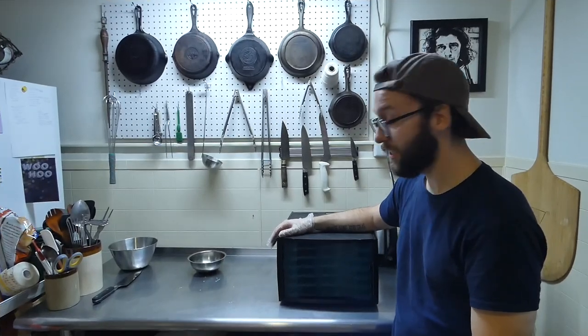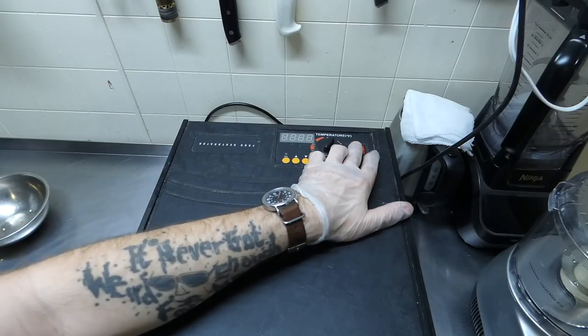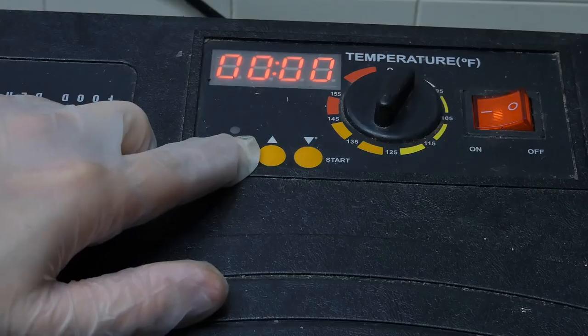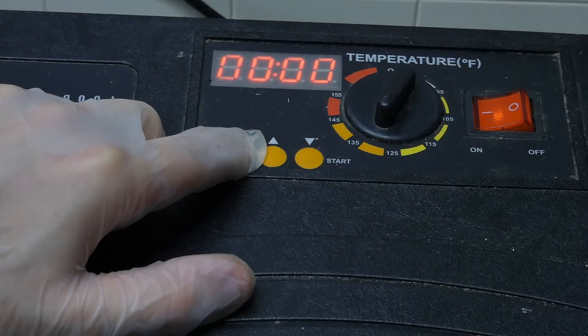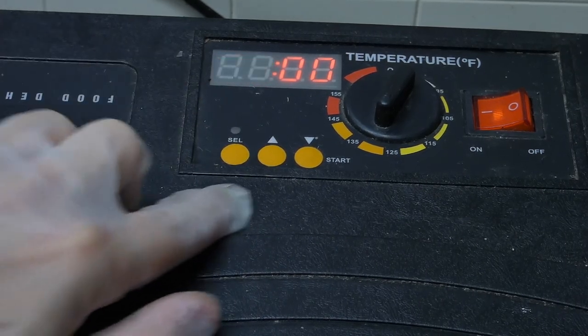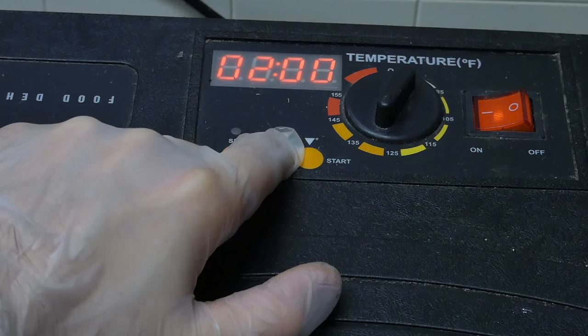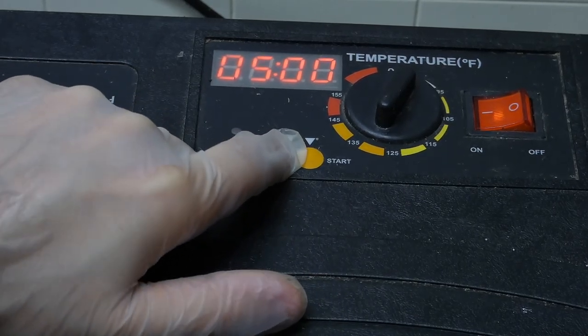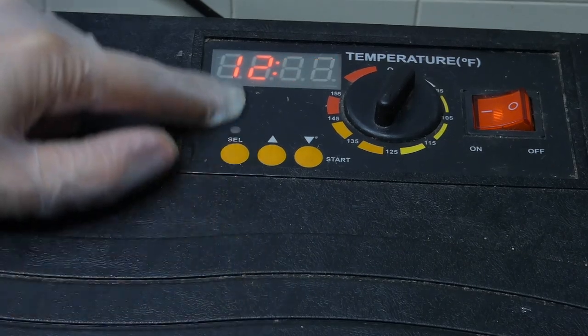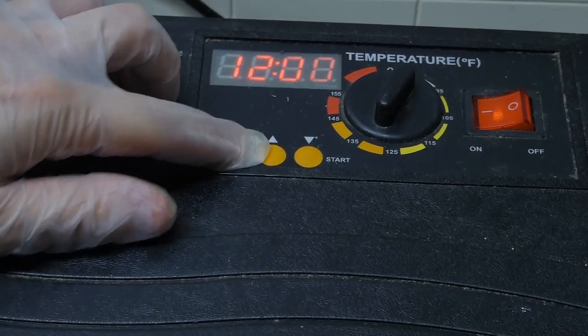Next step is to turn this on. All right, so for this machine, you turn it on here. This should be flashing. I'm not sure if you can see that. Then you're gonna hold down the select button, and that will start flashing there. And we're gonna set this for 12 hours to start. 12 hours, push select again, it'll go to minutes. If you wanna add minutes, I don't.